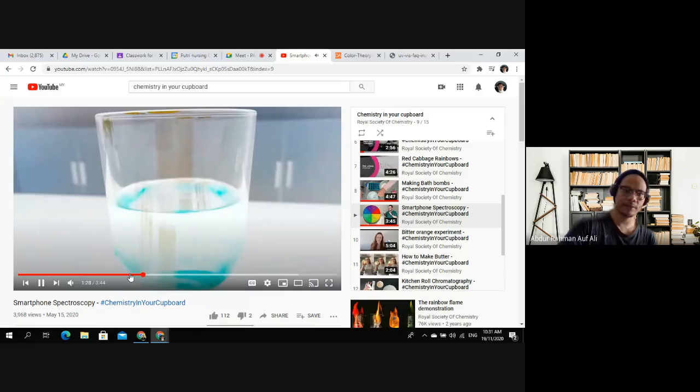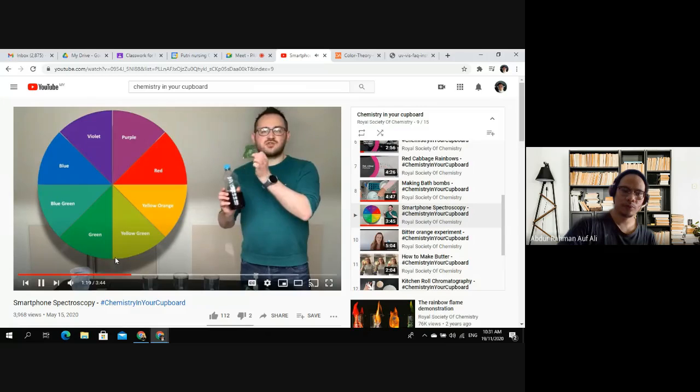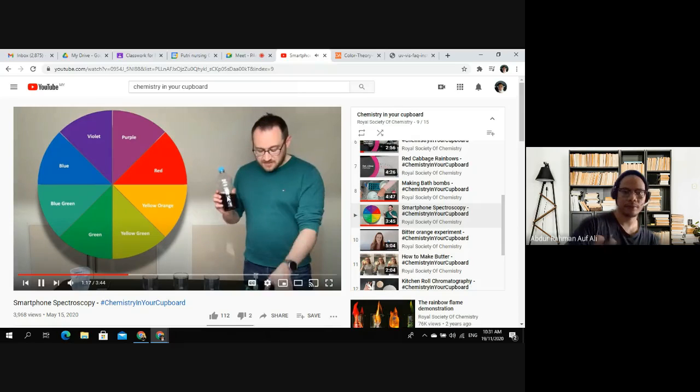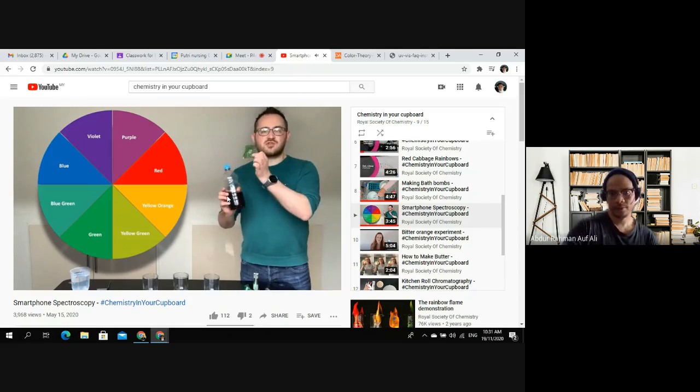Okay, this is an interesting thing. Kalau kita nak measure what is the color yang paling banyak diserap, kita tengok this wave color, tengok the opposite. So kalau black currant ni warnanya purple, kita tengok the opposite is green. Okay, so that means green is the most absorbed by this black currant water, black currant drink. So kalau kamu nak check that, kalau kamu nak confirm, kamu ambil gambar air black currant, kemudian kamu invert.